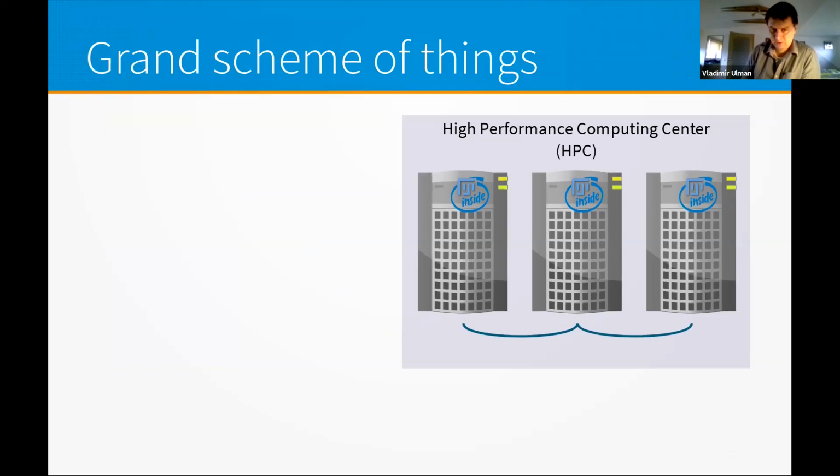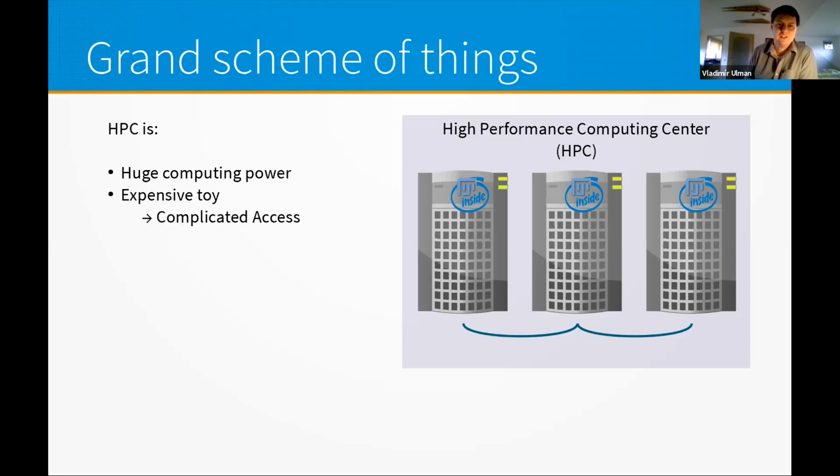Now a little bit of reminder about this HPC computing center. Michal has already touched on that. These centers represent a huge computing power. Of course, this is the reason why they were built, and that's also why we love them and why we want to talk to them or connect to them. But being such a computing power, it is also a very expensive toy, and as such, there are a lot of restrictions and a lot of policies and rules and documents.